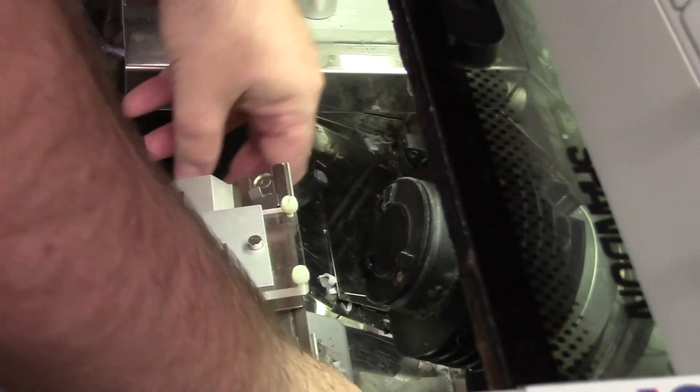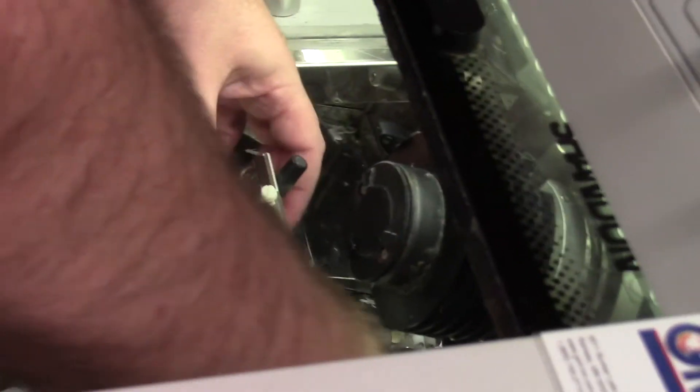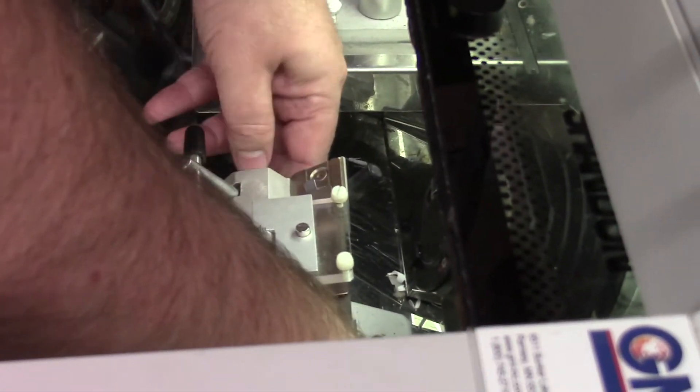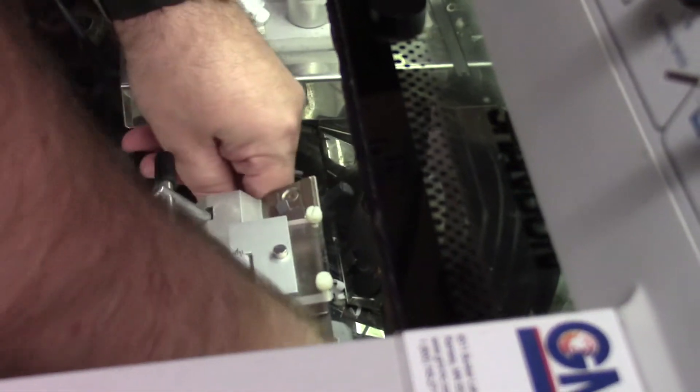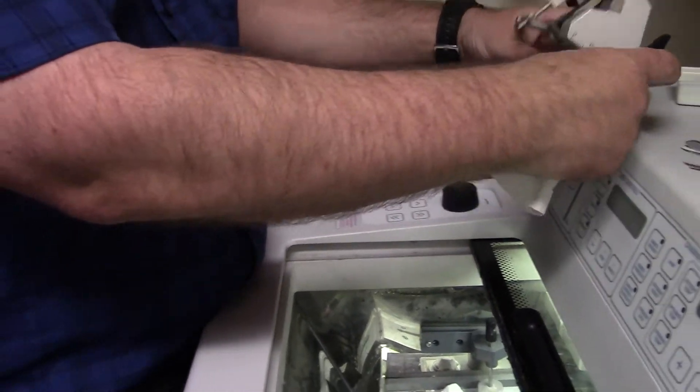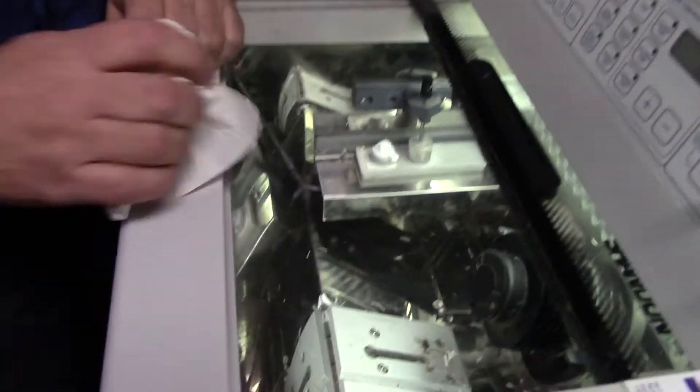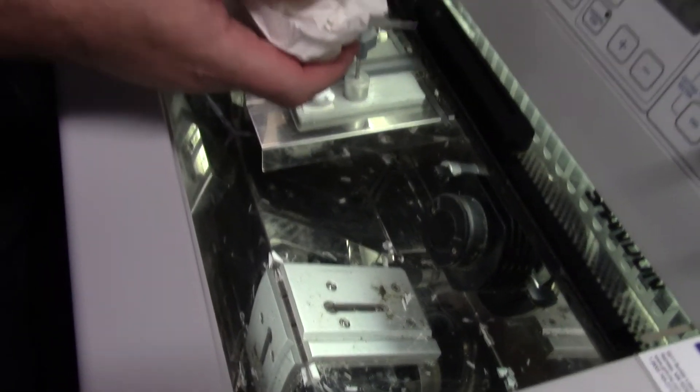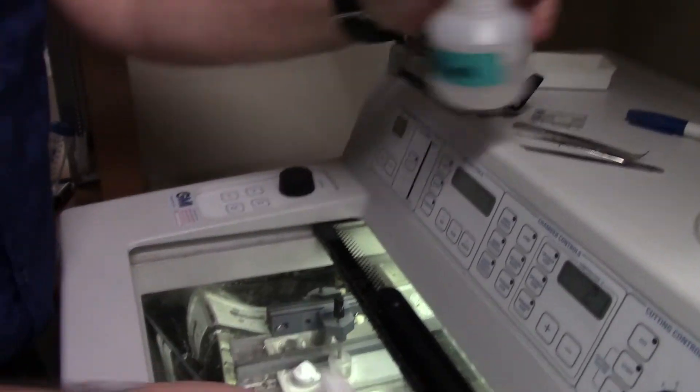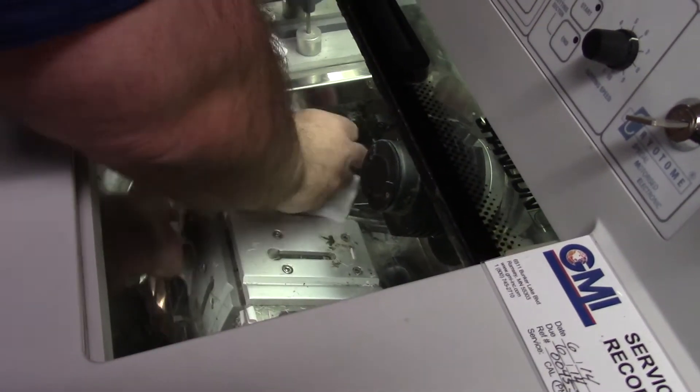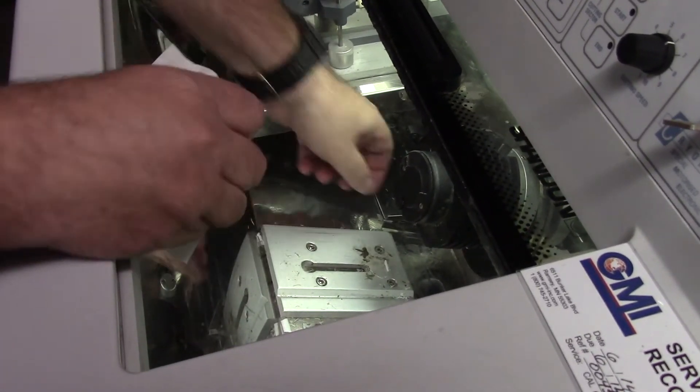I can also loosen this part, which is our blade holder, and expose all the nastiness. So let's do a quick spray here of 70% ethanol and we'll clean up all this extra tissue that has fallen into the back.